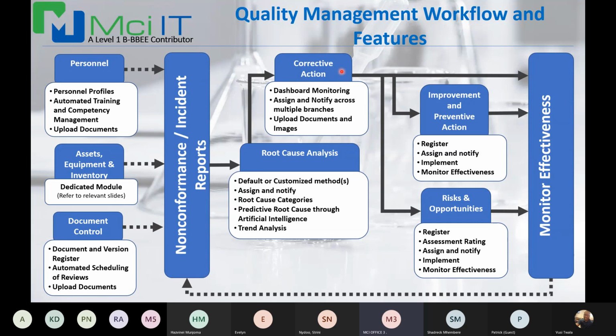For those corrective actions, you also need to identify actions for improvement or to prevent reoccurrence, and potentially also, and especially in the case of laboratories that are forced to, from corrective actions, identify risks and opportunities. From both actions of improvement and risks and opportunities, you'll identify and implement actions, and some time after having implemented those actions, you need to go and monitor the effectiveness of those actions.